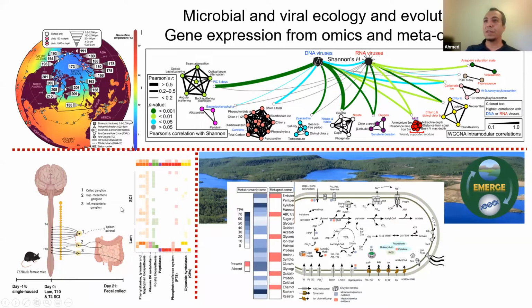So basically, you can also leverage some of the multivariate analyses and network analyses so that you can link the specific enrichment of taxa with the disease status that the mice are suffering from. Again, this is something you can use one of the tools I'm going to discuss today, WGCNA, for.